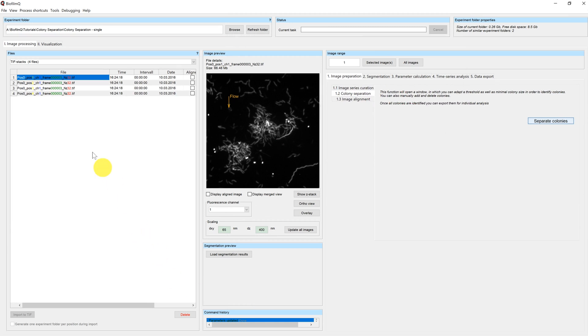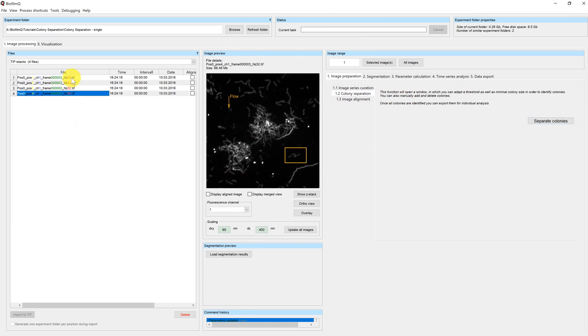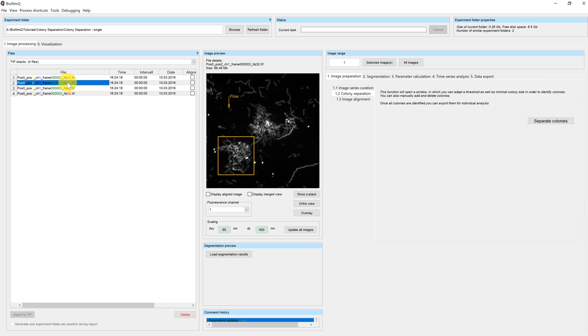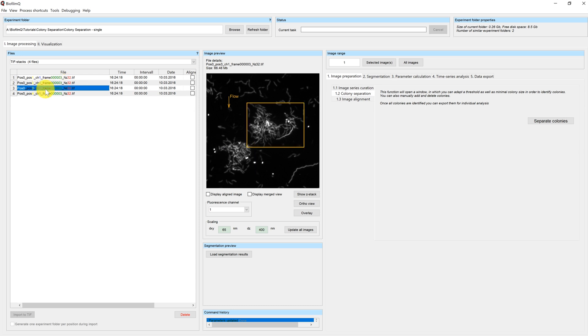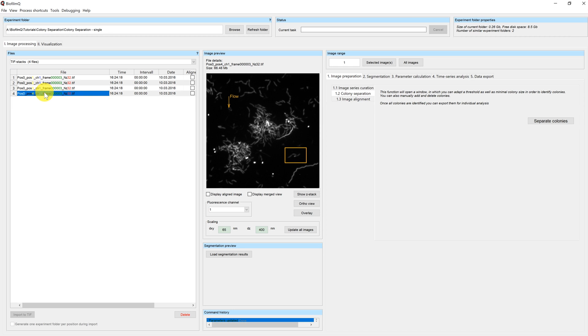You can see that three new files appeared. The first file is the original file without any modified cropping settings. The first new file, which is named position 2, belongs to the first selected biofilm in the colony separator. Position 3 corresponds to the second biofilm in the colony separator. Position 4 was the manually selected cell cluster in the preview image.